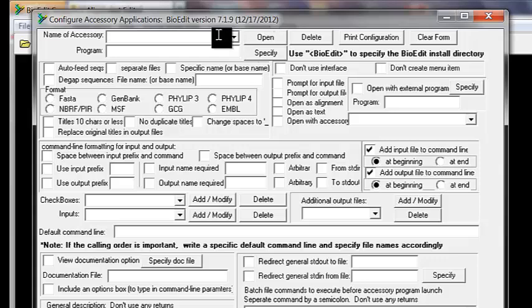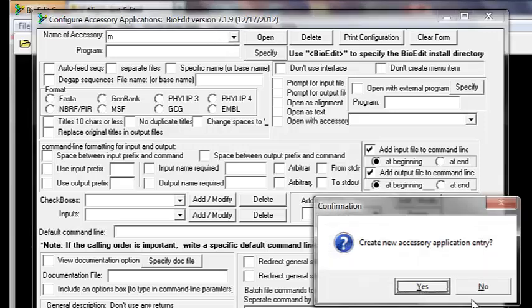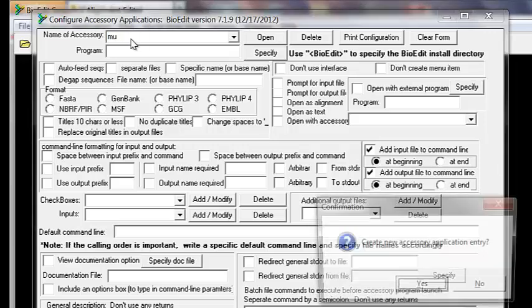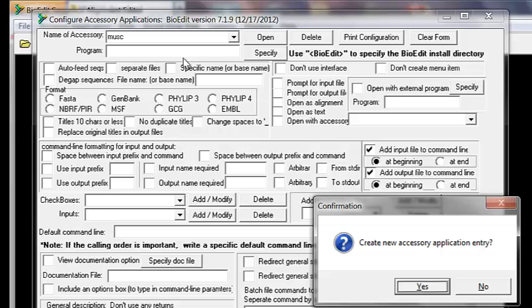Now we're going to type the name. There is a bug — at least in my version of BioEdit — where after every character you type it asks for confirmation whether you're done naming or not. So I type 'M', say no, and repeat for every character. I'll give it the name 'muscle'.